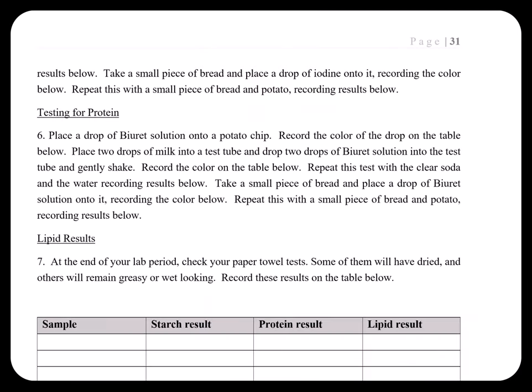It should be obvious the bread and potatoes are going to be starchy, and it should be obvious that potato chips, which are fried in grease, will be greasy. But it's a surprise if you have a piece of cheese and you leave it on a paper towel and you see the grease coming out of the cheese. Most people don't realize that.